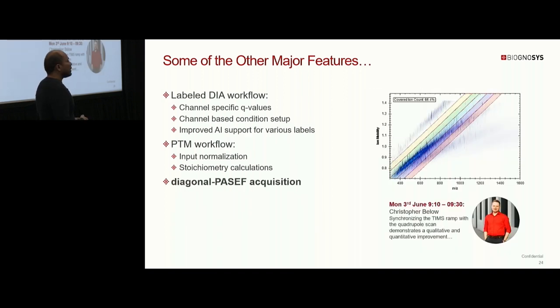And then I hope you all attended the DIA seminar yesterday, where Chris had a great presentation of diagonal PASEF. It's a really cool new acquisition method. I'll just point you to stream it if you didn't attend, to understand more about it. But Spectronaut 19 works very well with that.